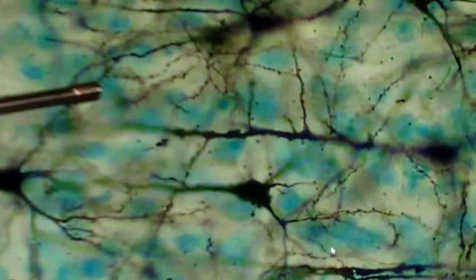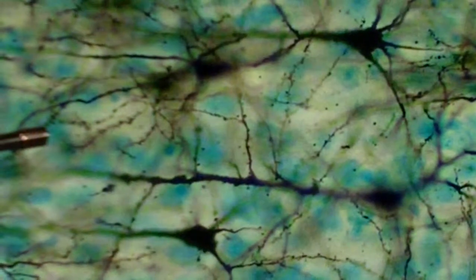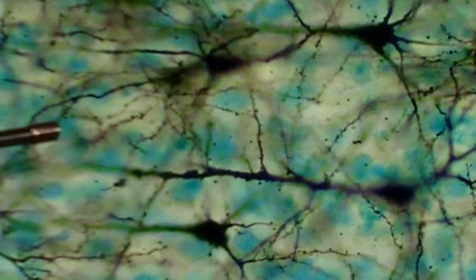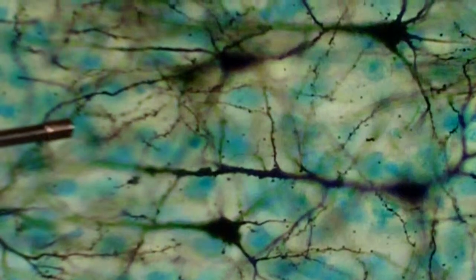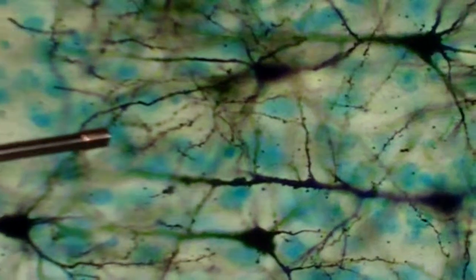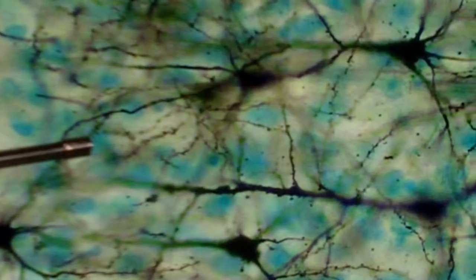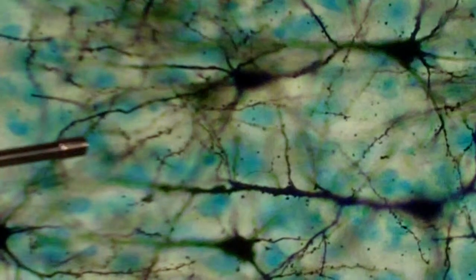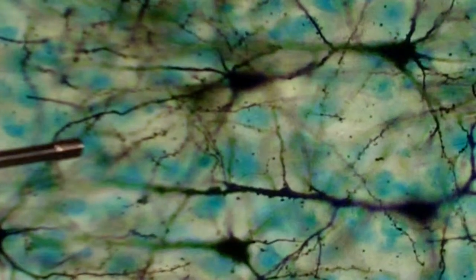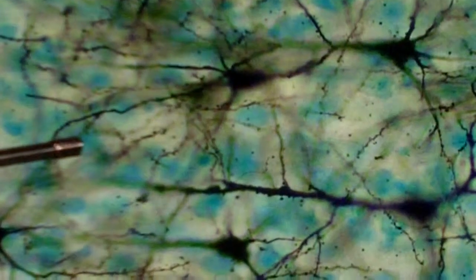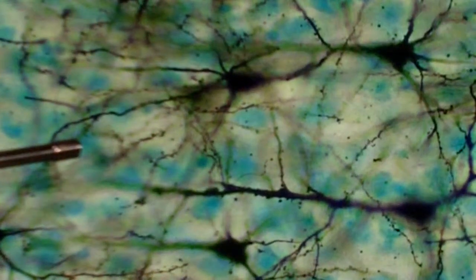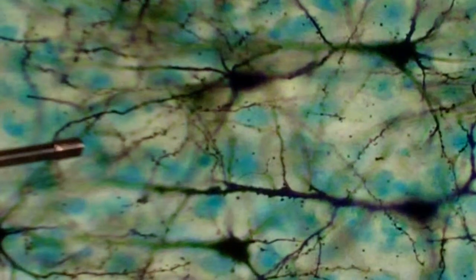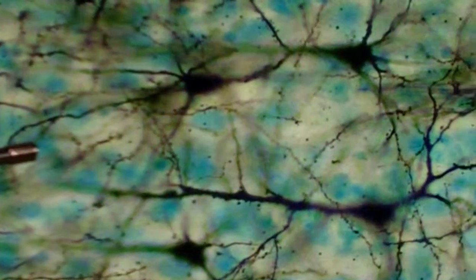Now if you watch these neurons that are stained with a Golgi stain on the monitor, you can see that we have about 30 seconds left, so we'll just let this run and let you see what's going on here.